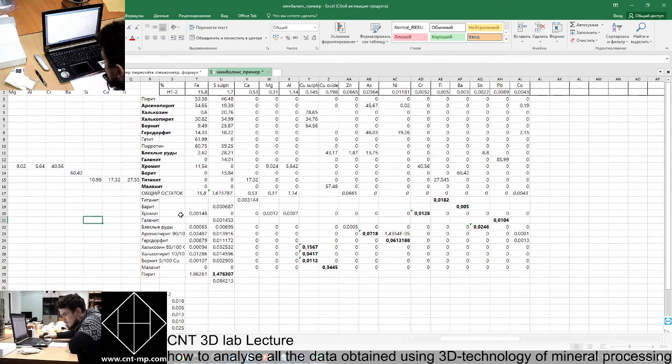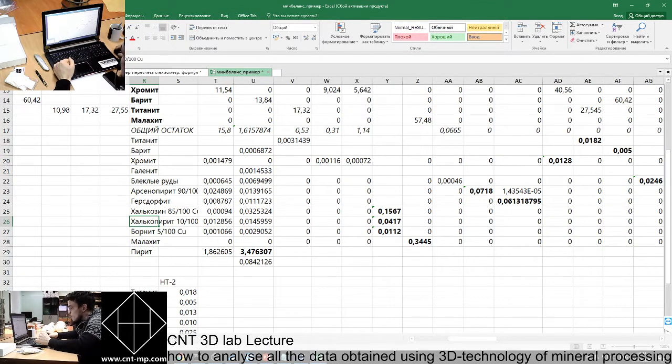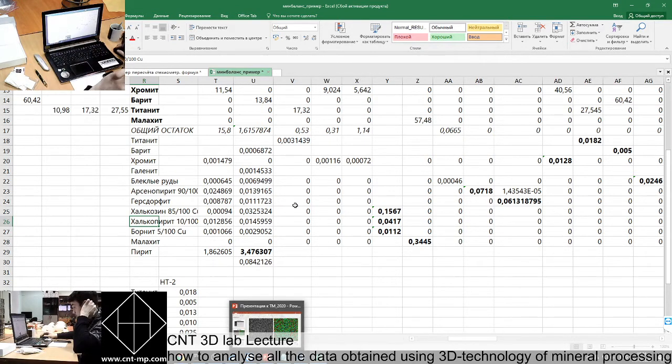So for example, in this work, guys tried to float to receive a copper flotation concentrate, and they were aimed at the main copper-bearing mineral as chalcopyrite, but it was shown to them that the main copper-bearing mineral is chalcocite, and they have very different properties for flotation, as the content of copper in chalcocite is more.